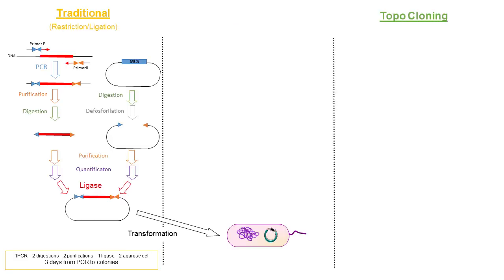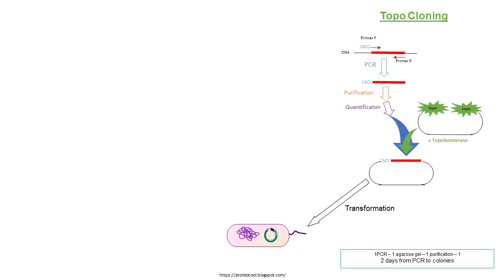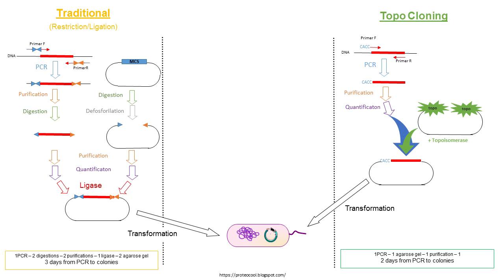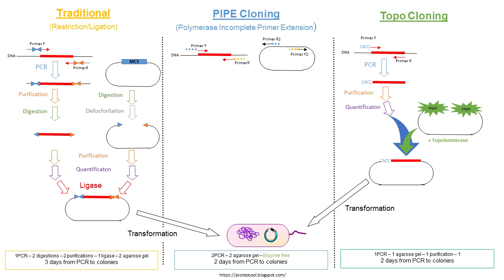On the other hand, differently from traditional restriction ligation, TOPO cloning is very simple, but it requires a specific kit that makes the system very expensive. And sometimes the gene insertion happens in the opposite direction, so when you are using TOPO cloning, you have to carefully check the sequence, screening a lot of colonies to be sure that you obtain the fragment in the correct orientation.